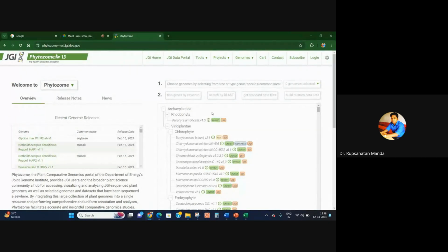If you are picking a primer from another reference, then you need to search where that primer is situated in your genome. But in most cases you will not get this result successfully, because most primers are sequence based.